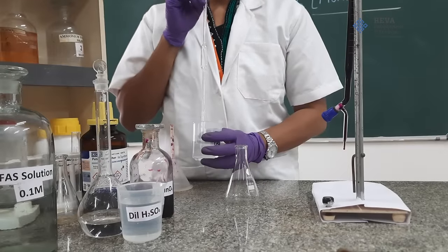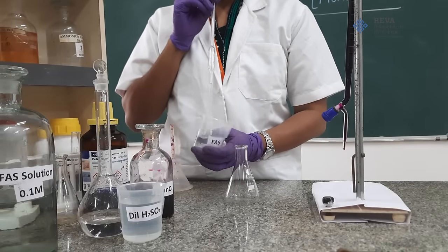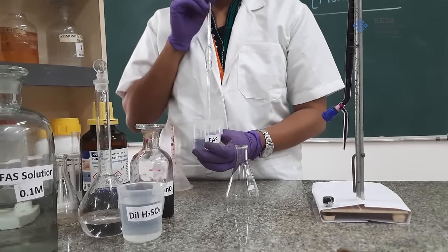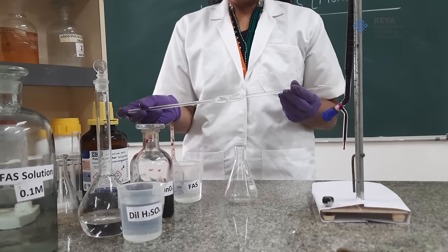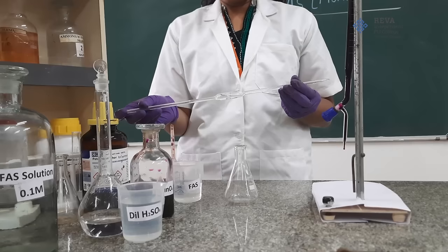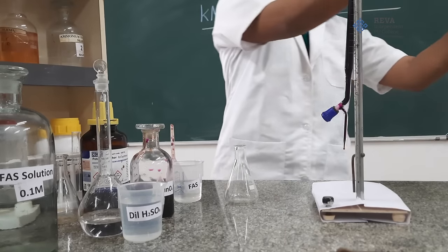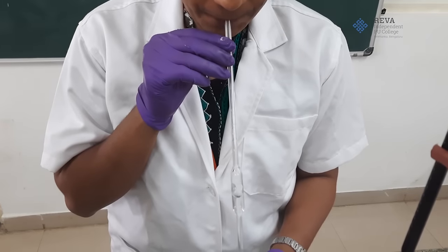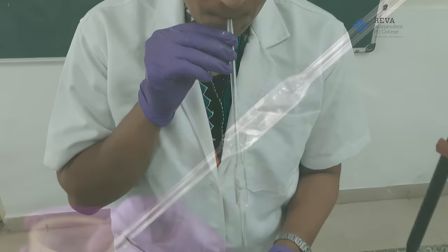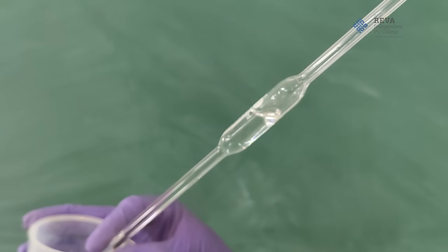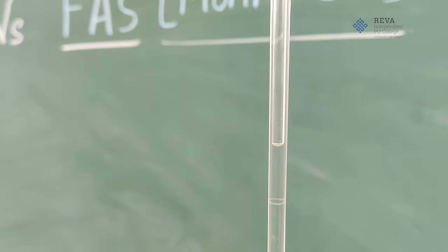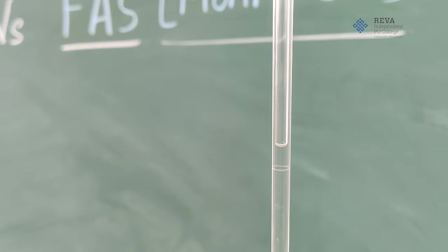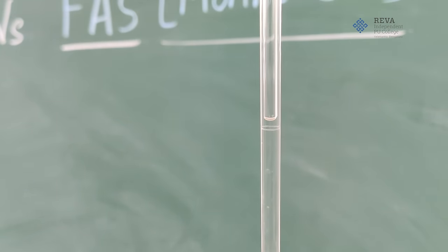Next, pipette out the little amount of FAS which is a reducing agent into a pipette and then rinse the pipette and discard this solution. Then pipette out 10 ml of ferrous ammonium sulfate solution till the mark.